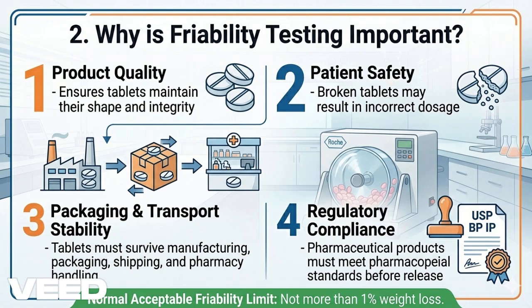Third, it helps evaluate the tablet's ability to withstand packaging and transportation. And finally, it is required for regulatory compliance, according to pharmacopeial standards such as USP and BP. In most cases, the acceptable limit for tablet friability is not more than 1% weight loss.